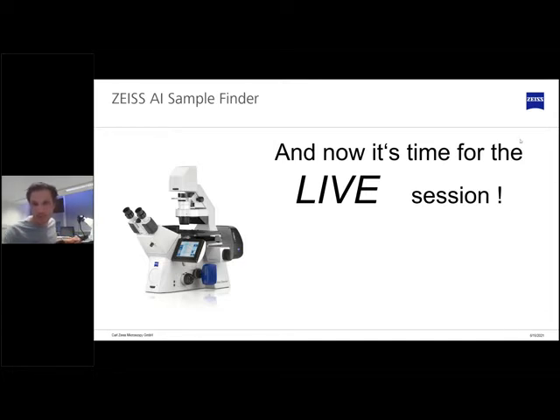Let me show my screen here and switch over to the microscope.